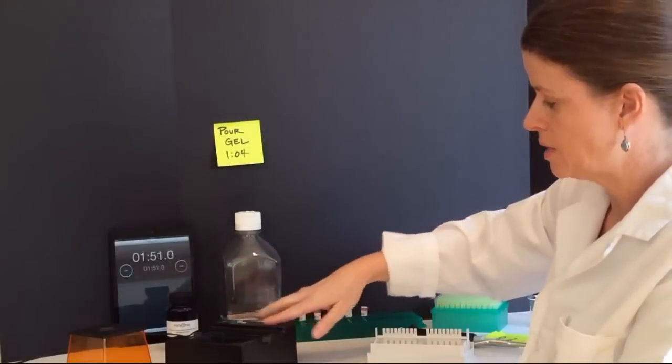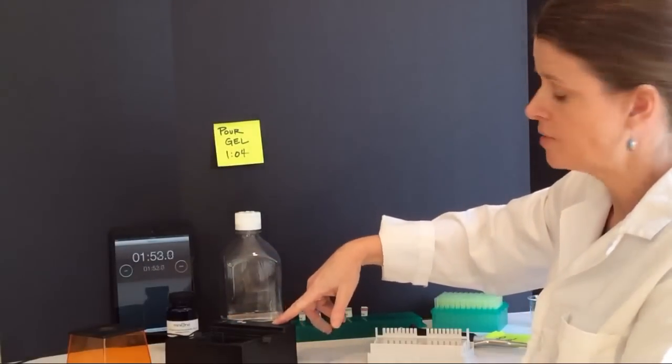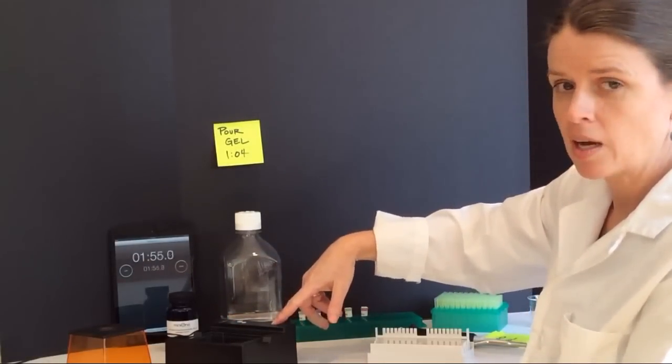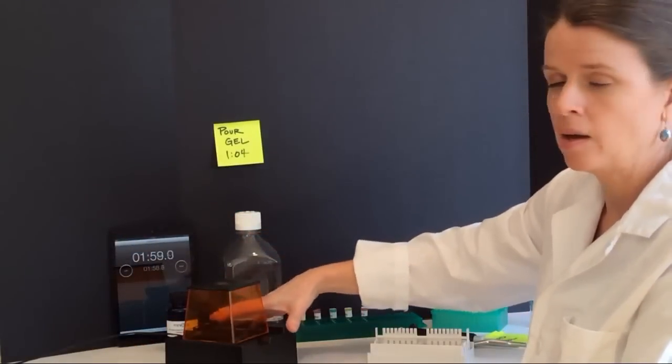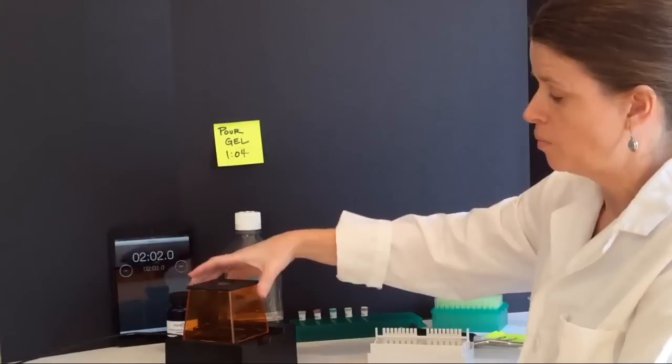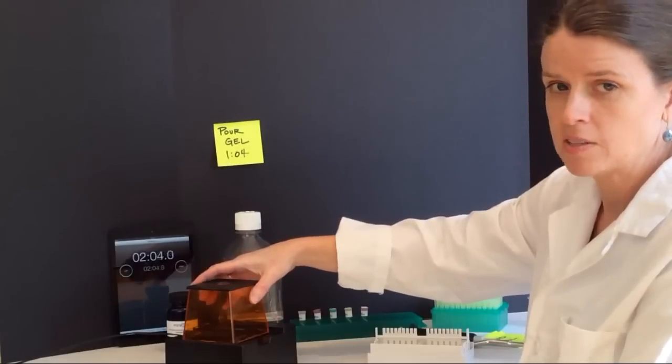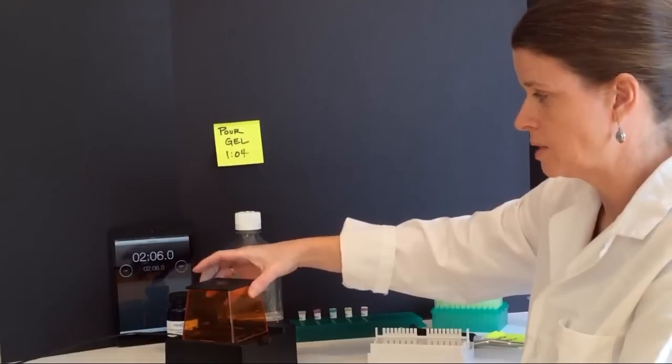The power supply is very simple. There's simply an on-off switch. But you'll notice this on-off switch doesn't work unless I have my top and my gel box filled with my running buffer. So there are a lot of great safety features built into the Mini One System.